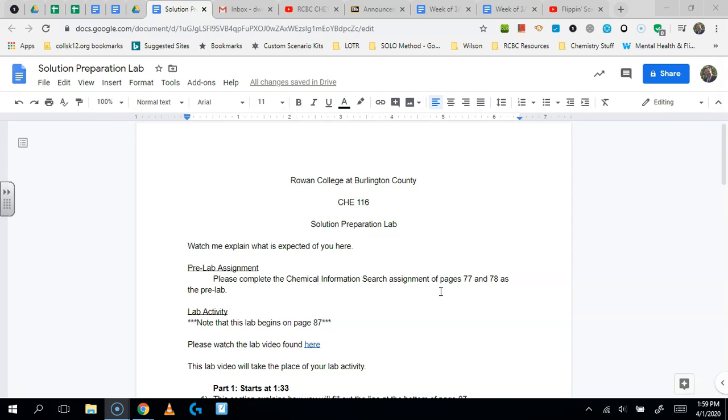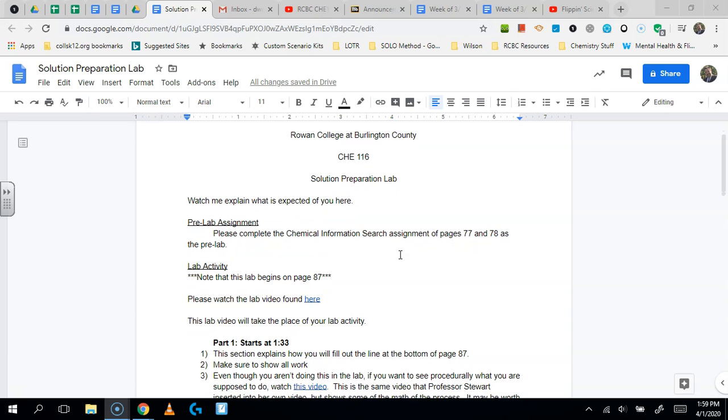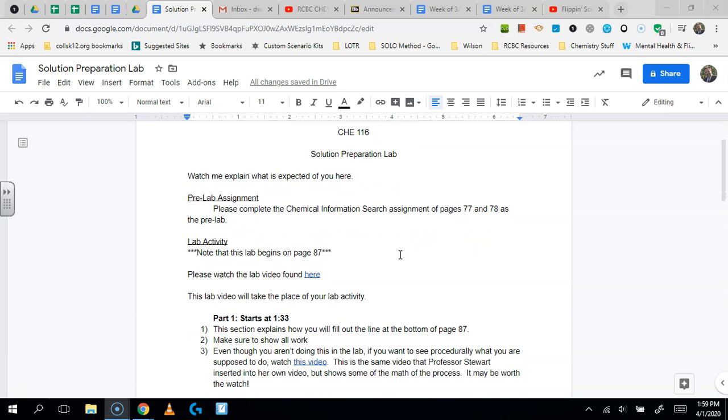Hey everybody, this is Professor Walsh, and I am going over all the stuff you need to do for the solution preparation lab. This is actually one of my favorite labs to do live and in person, because you get an unknown and then you have to try to figure out what the unknown is, and those are kind of my favorite things to do in chemistry, or at least as a professor, to give students to do, to be able to assign this.